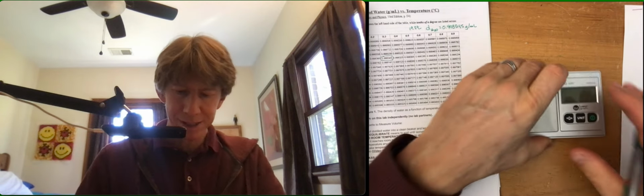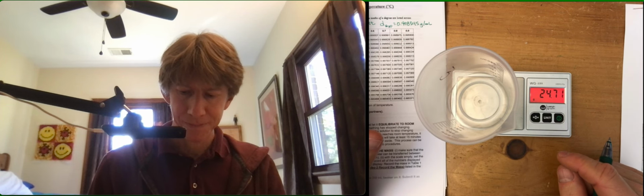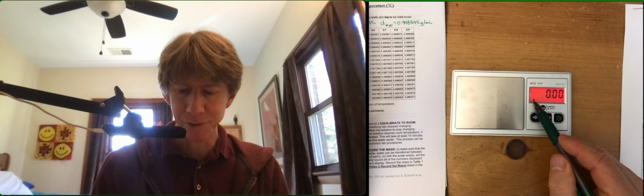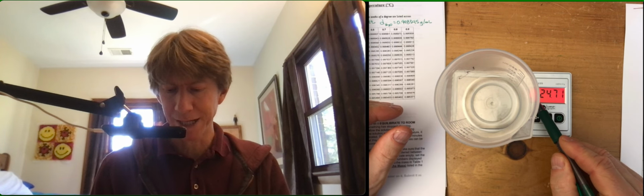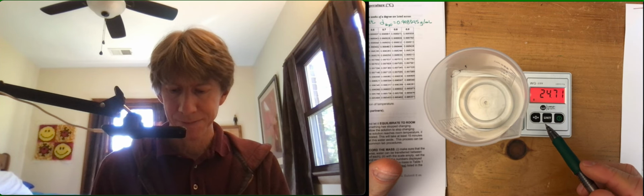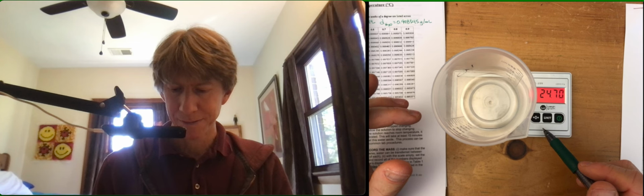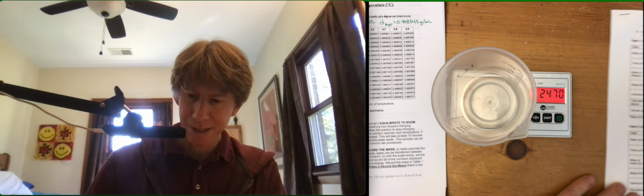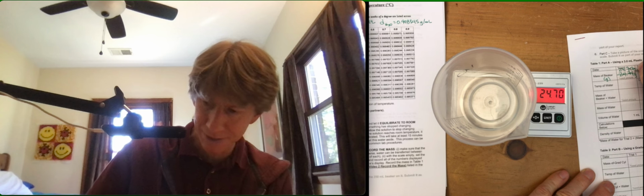All right, so actually I'm going to take this and do it again. I'm going to take my scale. Put it right on there. Good, 24.71. You'll notice that every time I put something on the scale, or before I put it on, I let the little dot appear. That means your scale itself is ready. And then I wait for the dot to appear before I write down the measurement. Oh, you can't see the dot, can you? Now you can see the dot, but now it's a 24.71. 24.70. Is it going to stay? Right. All right. So over here, I'm going to single cross out and write 24.70 grams right above it.